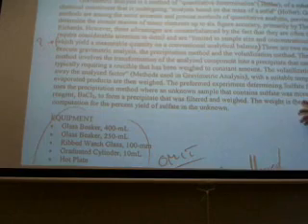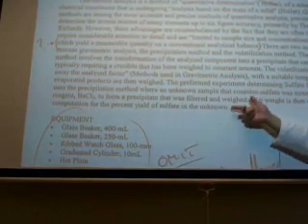Here, this is a different source, Holler, gravimetric analysis, and then something about sulfate here. And then sulfate from a sample uses the precipitation method. Okay, this is what we did in this experiment. This volatilization method and the precipitation method. And they're just saying in this experiment we did the precipitation method. That's good.